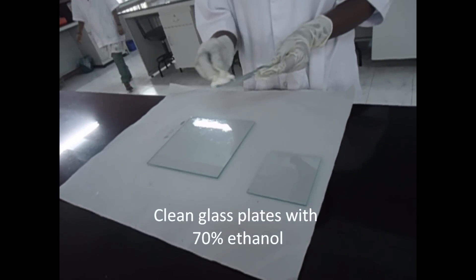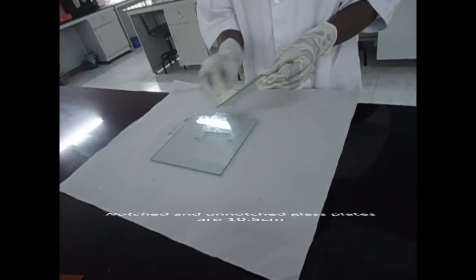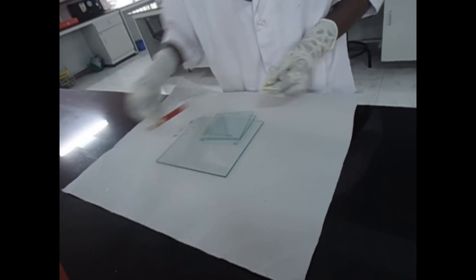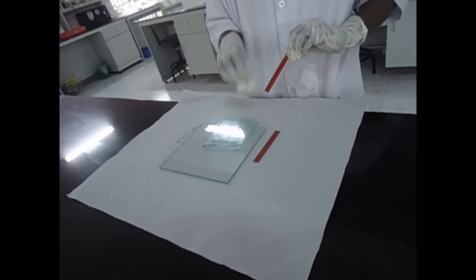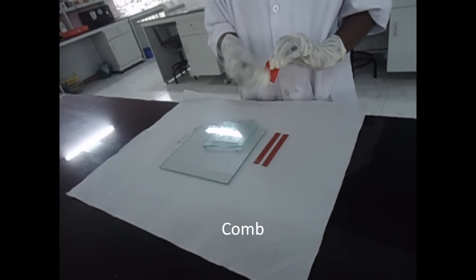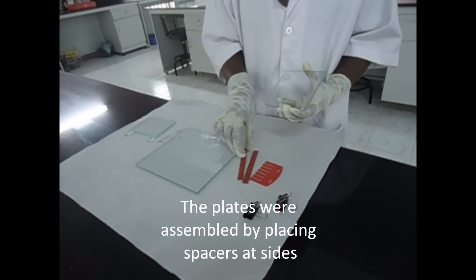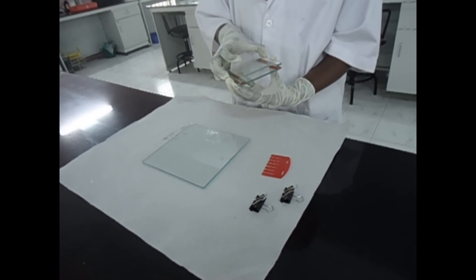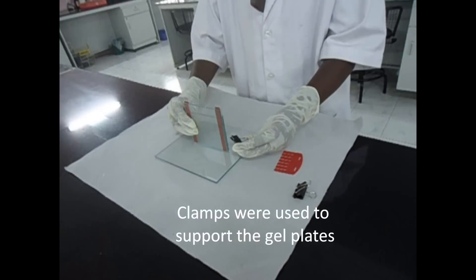Clean glass plates with 70% ethanol. The materials required are a vertical gel electrophoresis system including notched and unnotched glass plates. Spacers are of 0.75 or 1 mm thickness, and a comb for making wells. The plates were assembled by placing spacers at the sides, and clamps were used to support the gel plates.